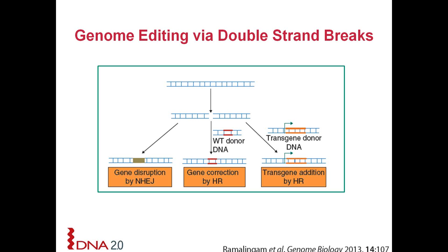So in this case, you would supply the guide RNA along with a donor cassette. A third thing which is convenient using this method is by supplying a cassette that allows for replacement of a gene. So you can not only knock out a gene, but also replace it with a different gene, here shown with maybe a 1 or 2 kb sequence where it has upstream and downstream homology, along with a new gene to replace the existing wild-type gene. So lots of these things can be done.